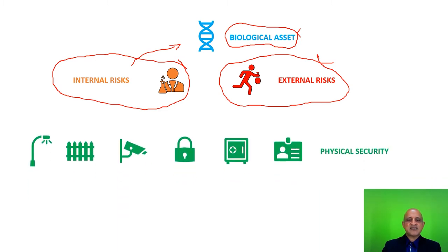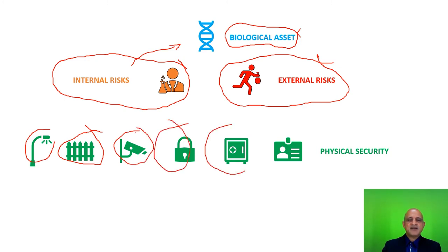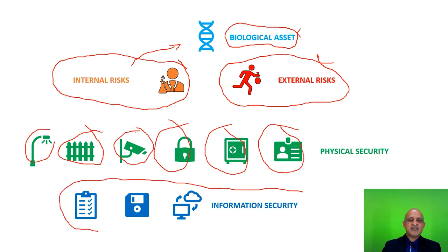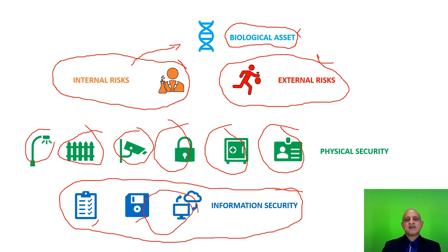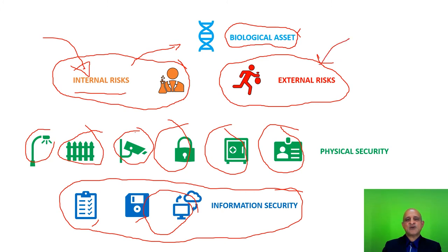Physical security is addressed in the form of general security measures: lighting, security barriers, CCTVs, closed circuit cameras, locks, inventories, and personal security in the form of identity cards. We also have to implement information security, which may be in the form of checklists, secure cloud storage, and storage of documentation within the facility itself. For internal risks, personnel screening may be done in consultation with your local law enforcement authorities. External risks must be addressed based on regional requirements, including threats from bioterrorism as well as theft of the biological agent.